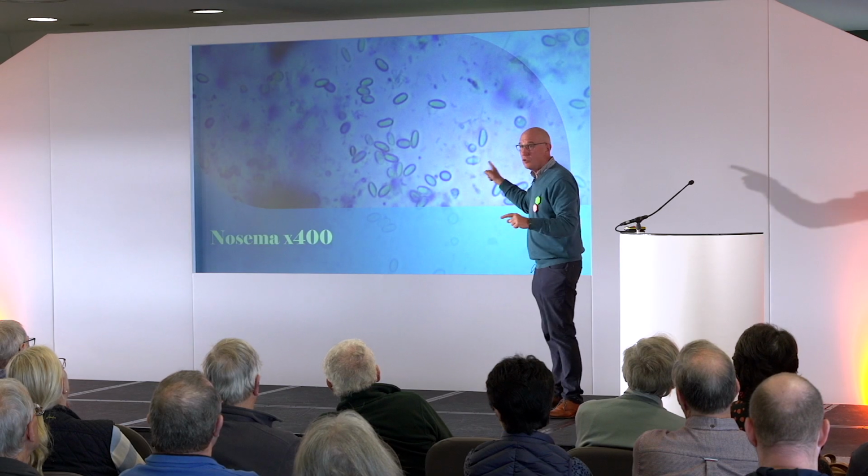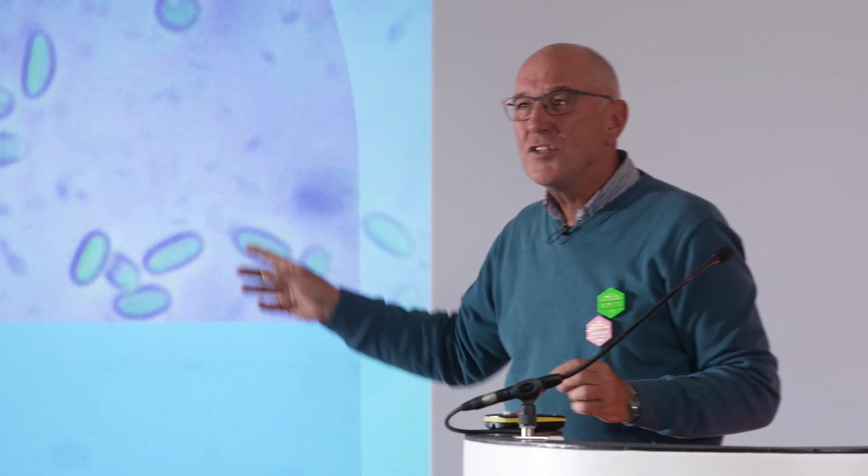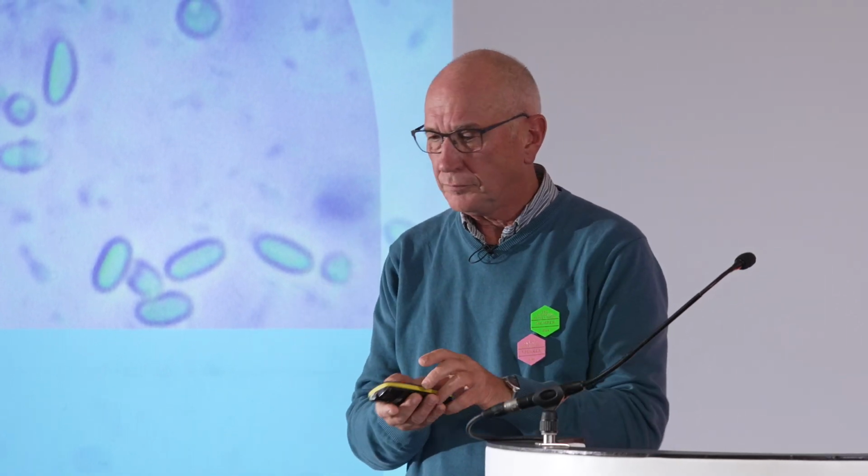And if I see Nosema in my first view, and this is a first view photograph, then that says I've got lots of Nosema. If I have to hunt hard for Nosema, then that's not at a level which is of concern. This is of concern. And there's no real measurement on Nosema, but it's costing us 30 bees every time we do a test. And when you do your test, and if you see it easily, then you should be concerned and then take other actions.